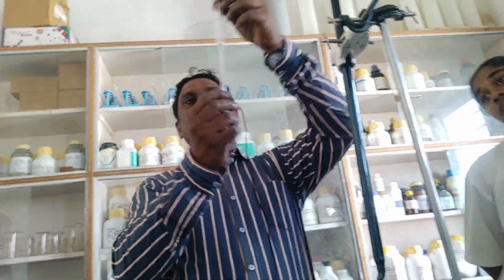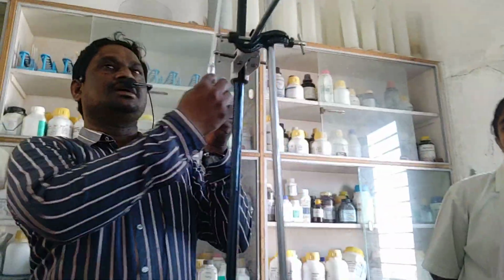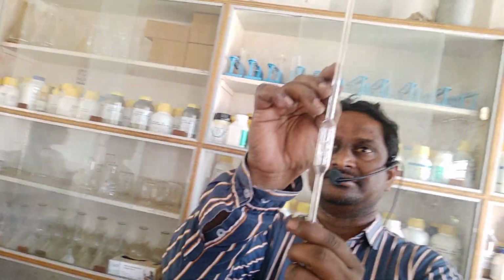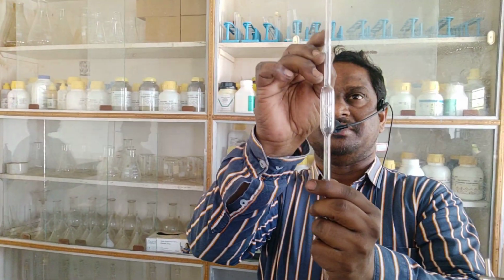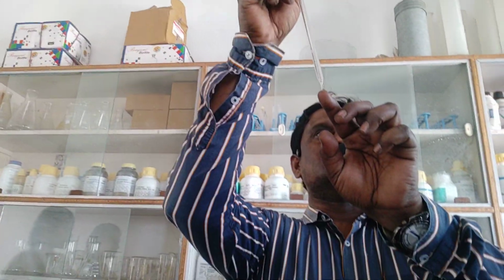Now look here, all of you. This is called a pipette. Observe how many ml is there. 10 ml is there. So this is a 10 ml pipette. Observe carefully, students. Here a mark is there. Up to this mark only we have to suck the FAS solution. So this ending is called the nozzle.